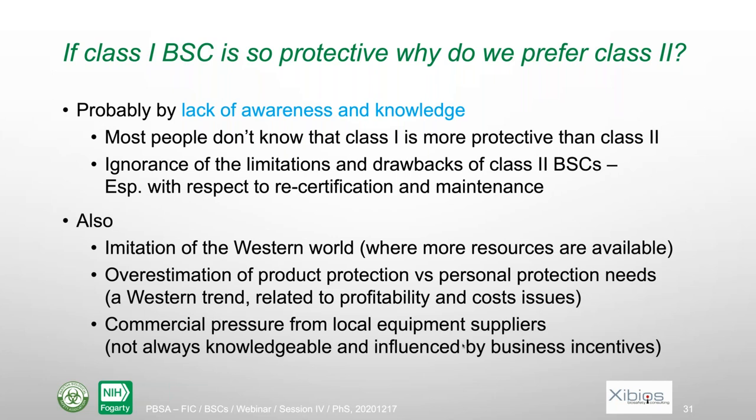The next question is in relation to that, if class 1 BSC is so protective, why do we prefer class 2? Actually, my feeling is that it's probably because of a lack of awareness and knowledge of the users, but also of the biosafety professionals, many biosafety professionals, and also of the suppliers of cabinets. I think that most people don't know that class 1 is more protective than class 2. And if you ask a number of people back in your lab, they will probably say the opposite.